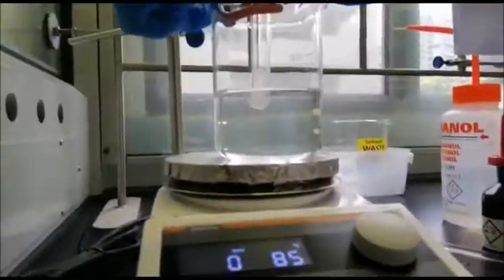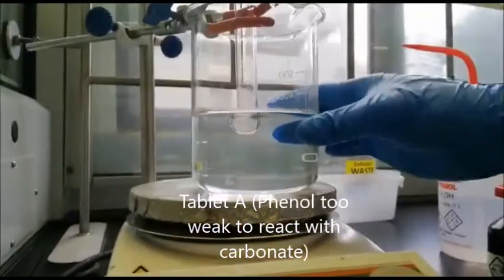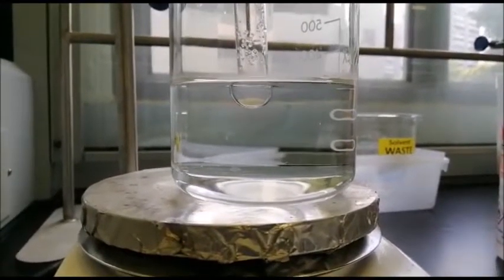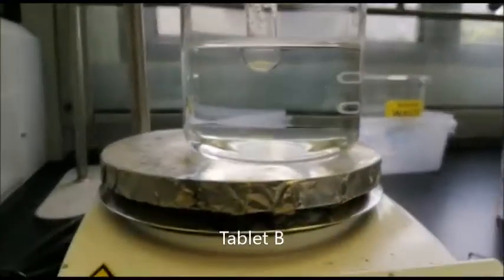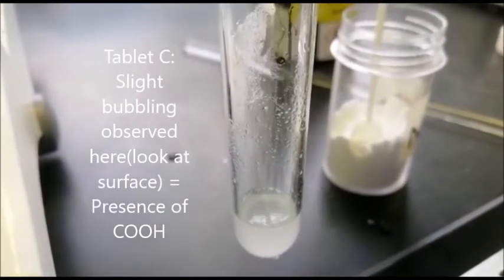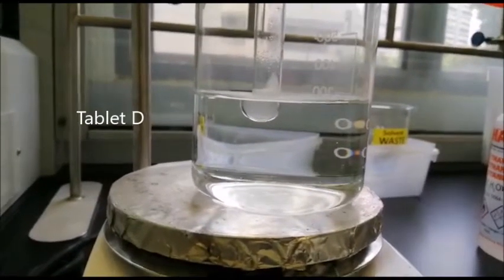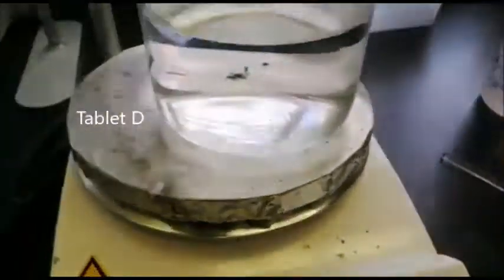The second test is adding sodium bicarbonate powder to a fresh sample of water-dissolved drugs heated in a water bath. We placed the test tube in the water bath after the carbonate was added to provide a bit of heat, as not too much heat is required. This was a neutralization test to identify aspirin, the only drug with a carboxylic acid group. It would react with sodium bicarbonate to be neutralized, causing effervescence or bubbling. This test also proceeded as expected, with only drug C, later identified as aspirin, reacting to produce a slight bubbling as seen here.